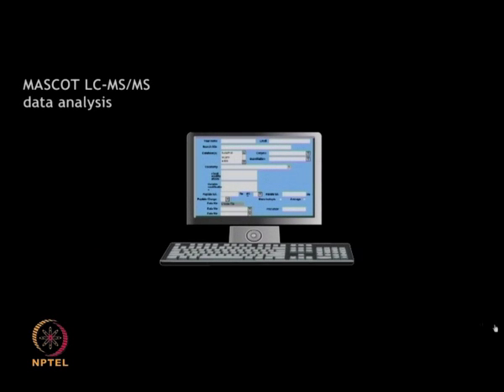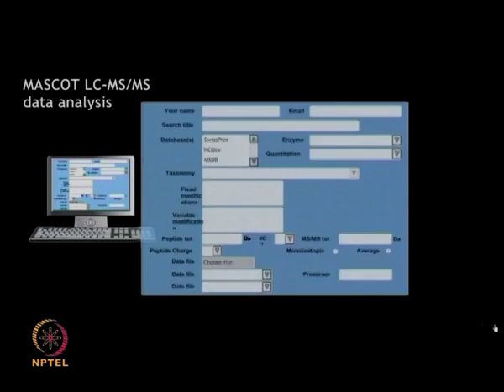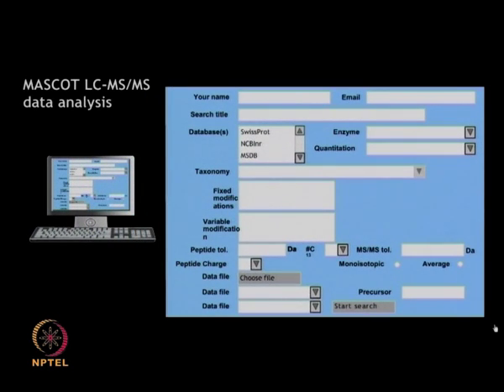The data obtained from tandem mass spectrometry following SILAC experiment can be analyzed by means of Mascot search engines.